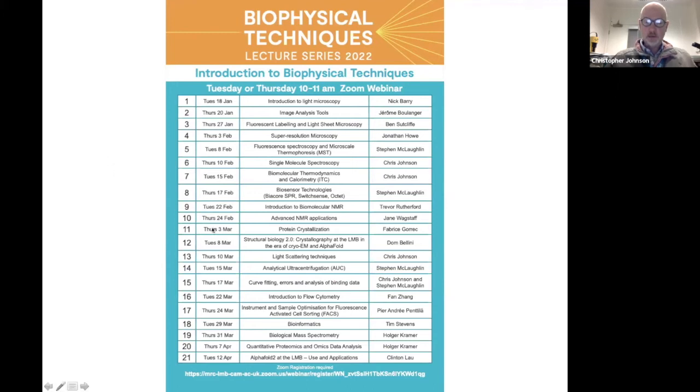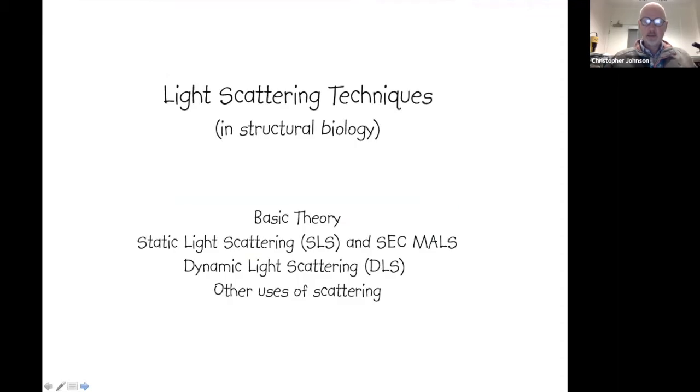So today's talk is about light scattering techniques. There's quite a bit to go through, and I apologize if I don't keep within the hour, but I will do my very best to do that. And the talk's divided into these sections here. I'm going to cover the basic theory of light scattering.